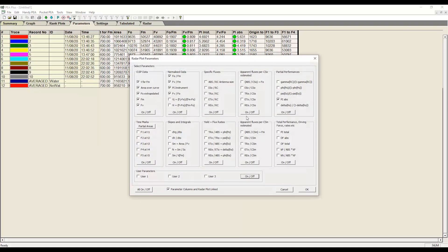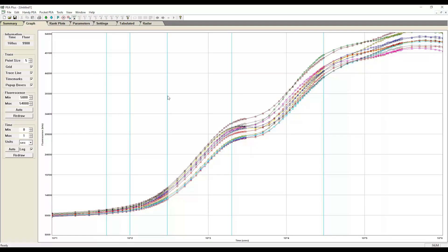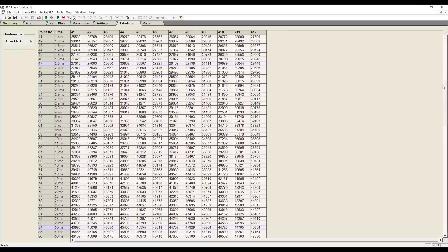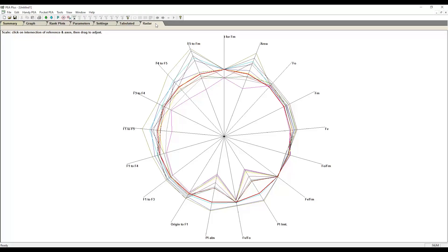This powerful application automatically calculates over 50 parameters. It provides detailed OJIP analysis and versatile data display, including graphical, tabulated and radial formats. You can easily export your data to CSV files.